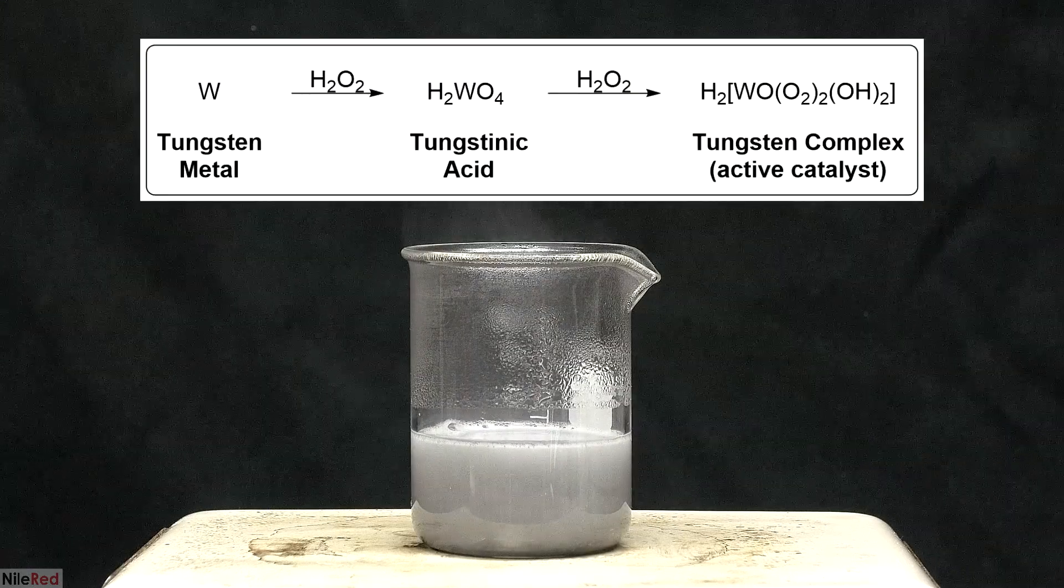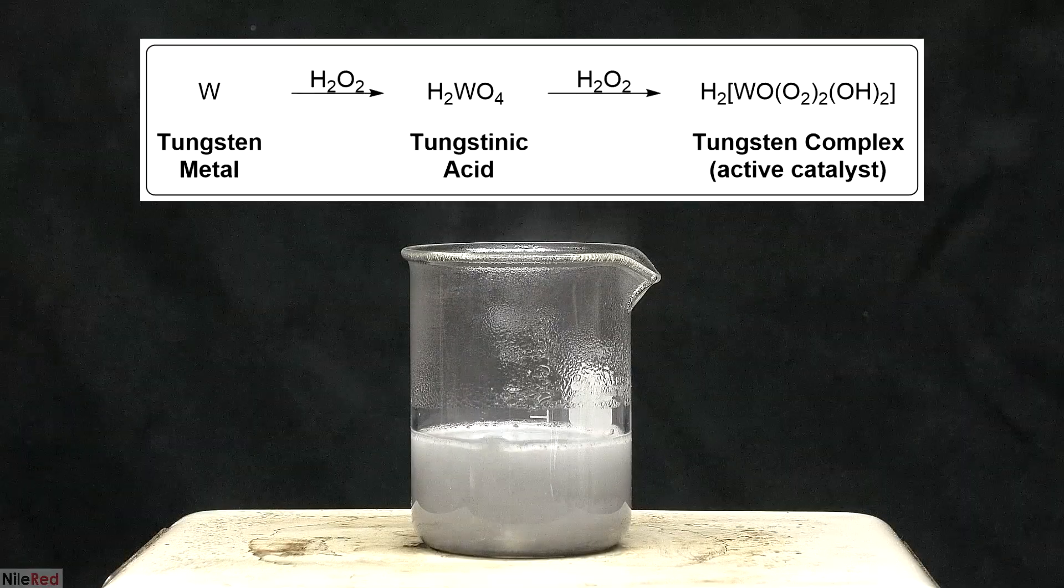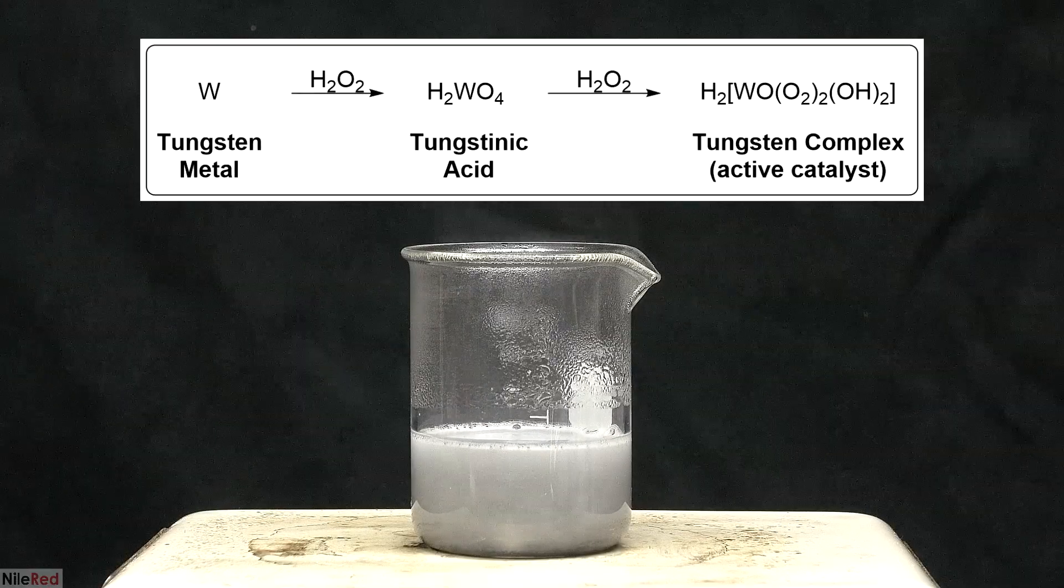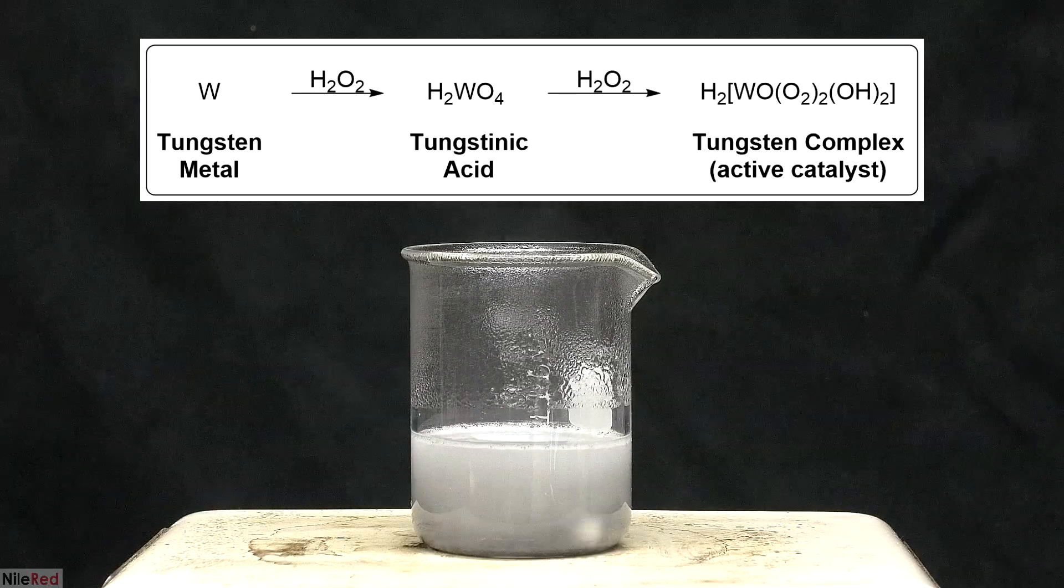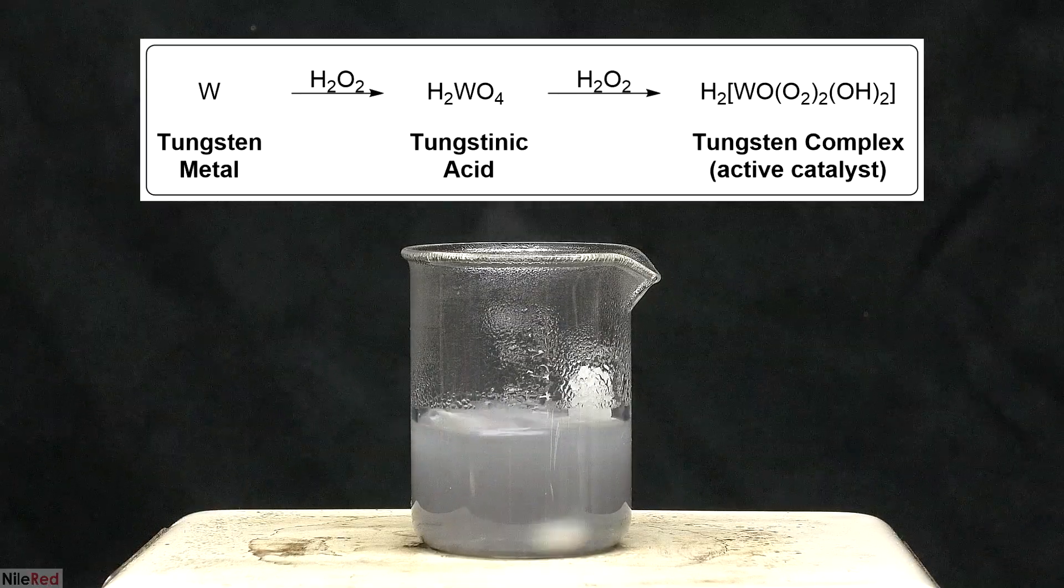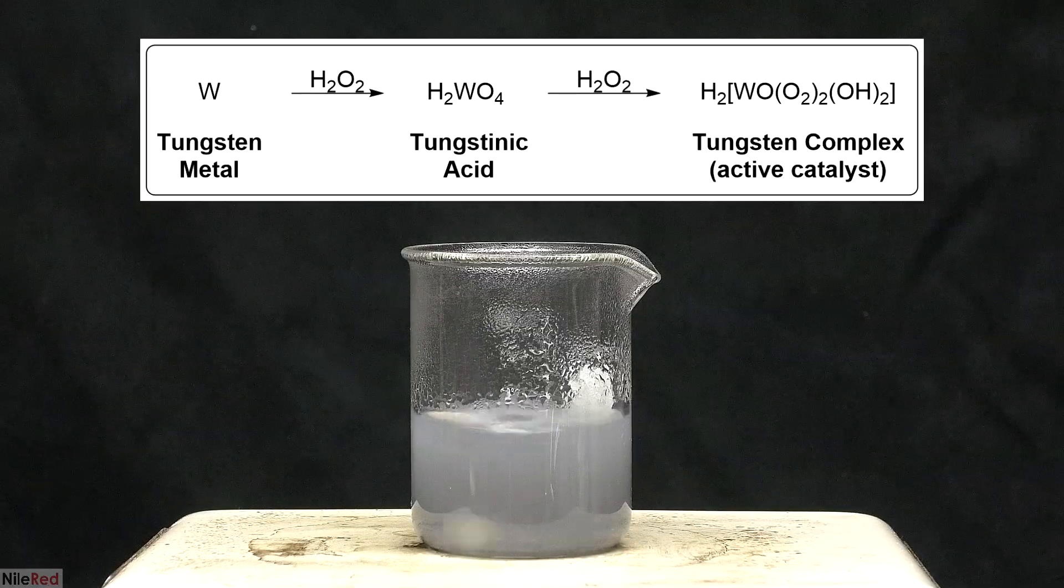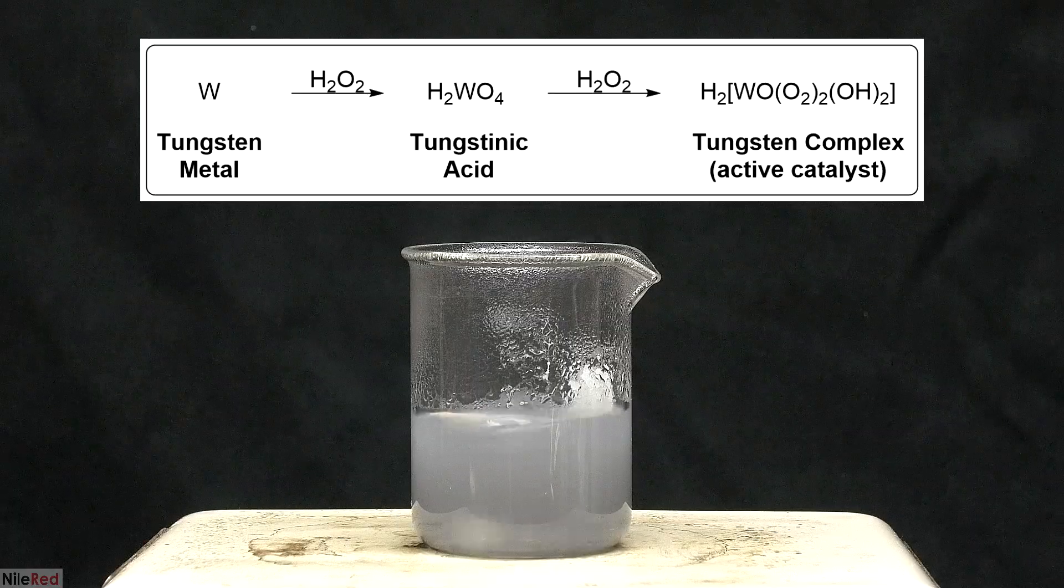What we have going on here is hydrogen peroxide reacting with the tungsten metal to form tungstenic acid. Tungstenic acid is normally insoluble in water, but in the presence of peroxide, it forms a water-soluble complex. As far as I know, this complex doesn't really have a name, but it's the active catalyst for the reaction.